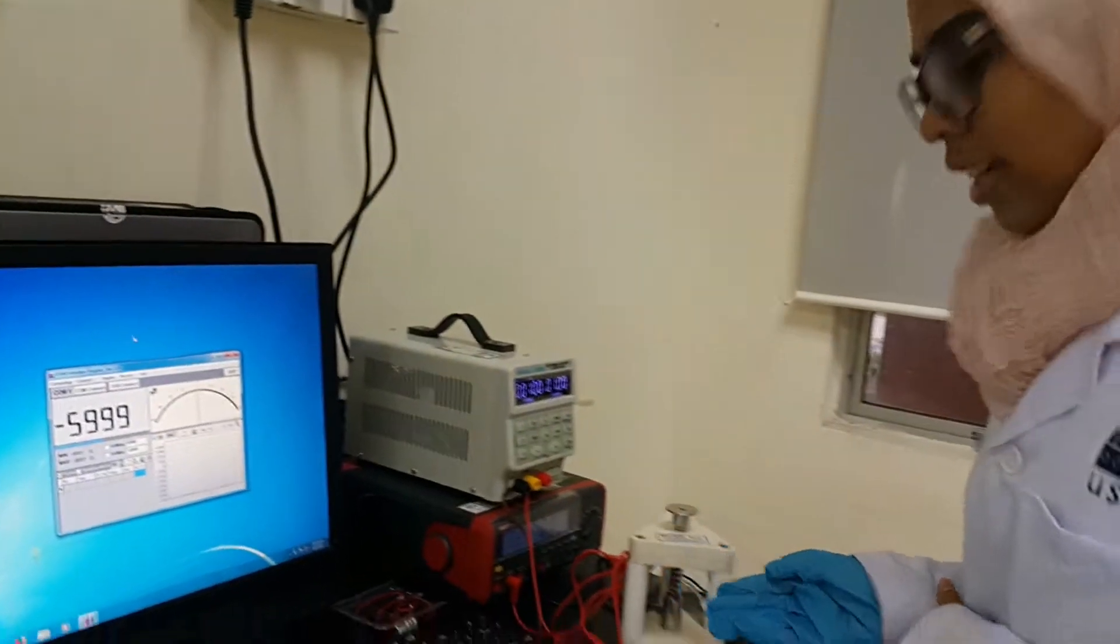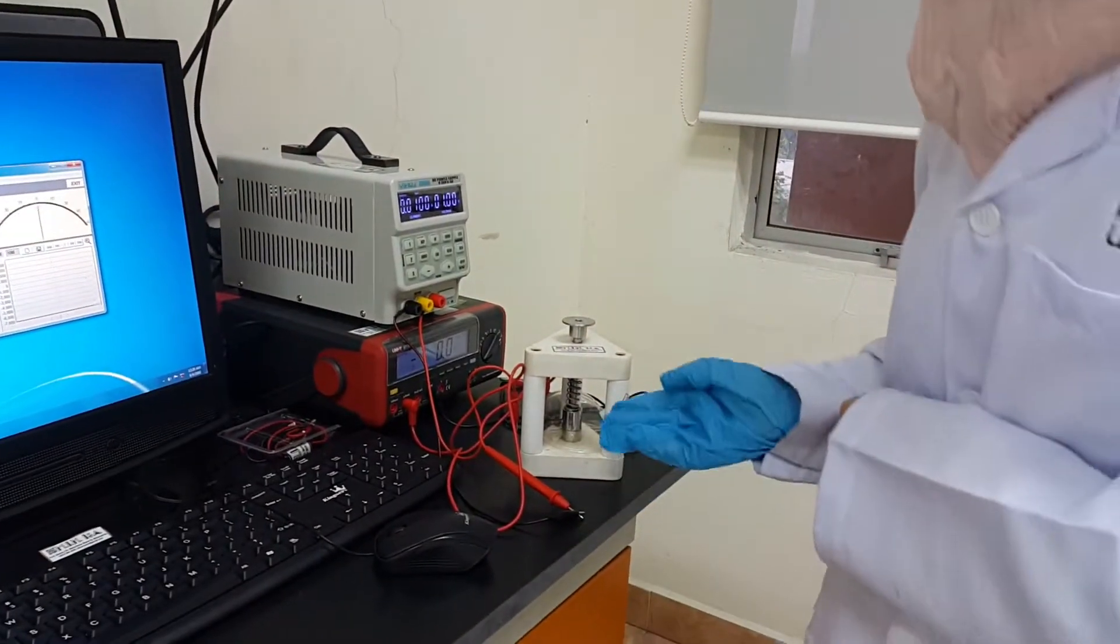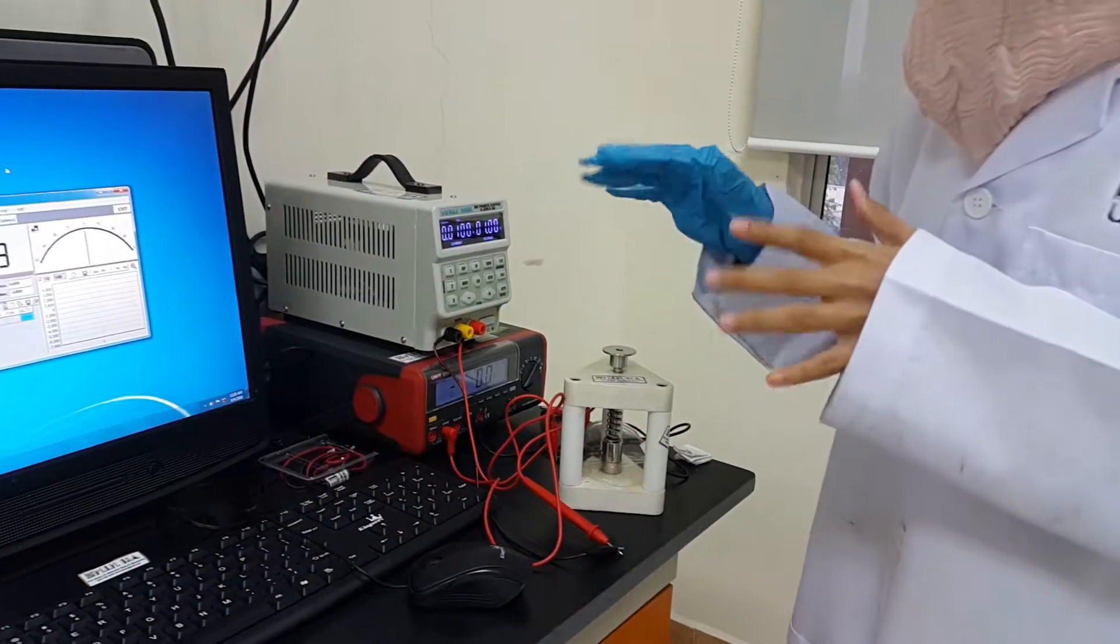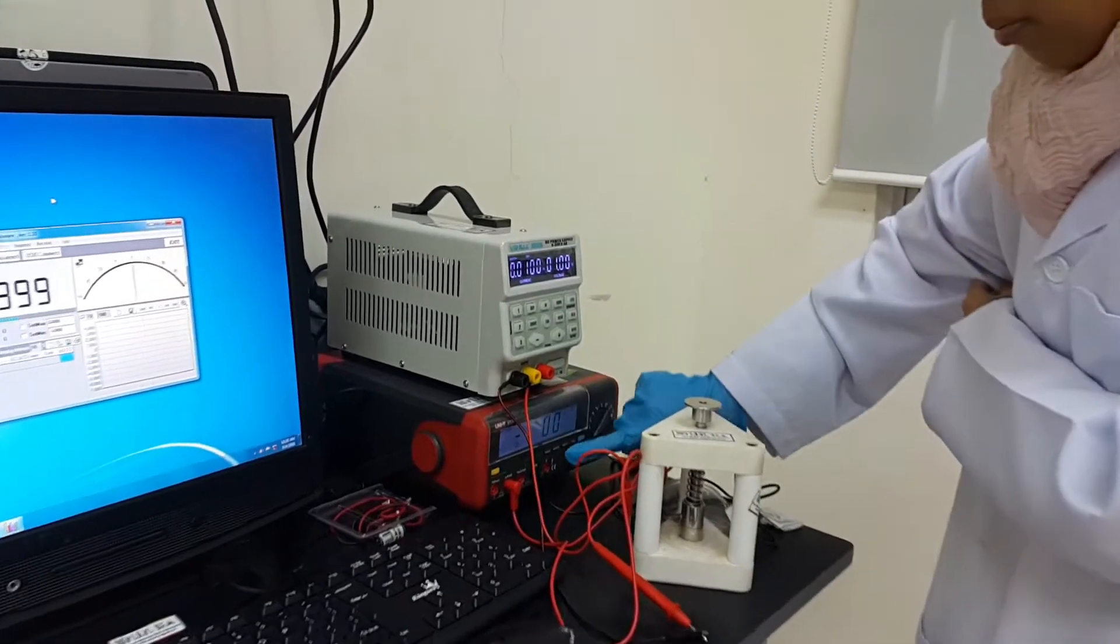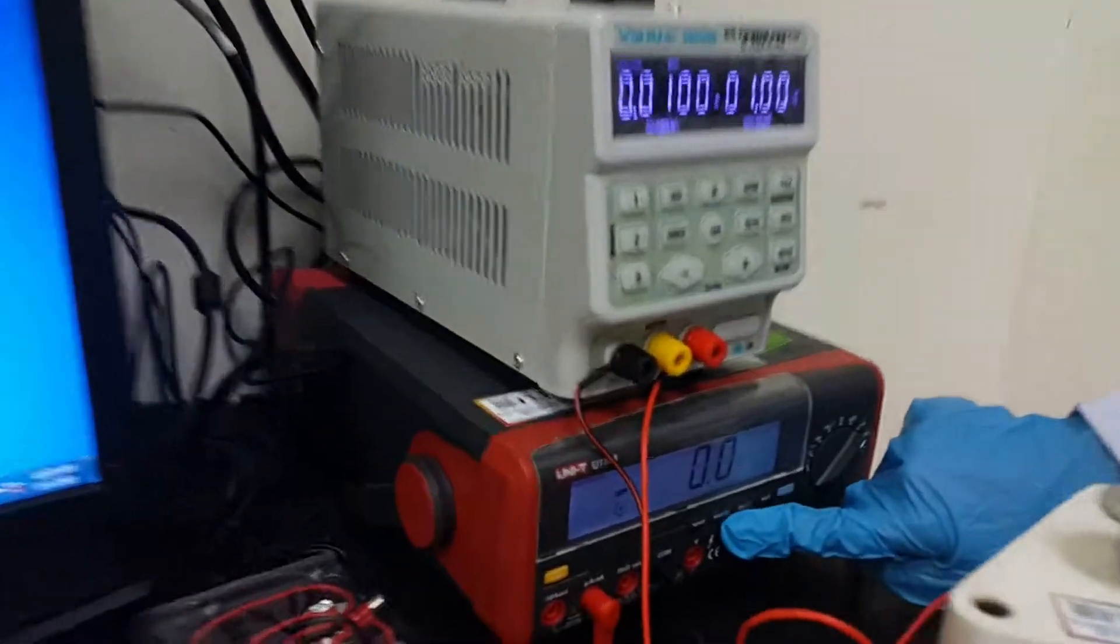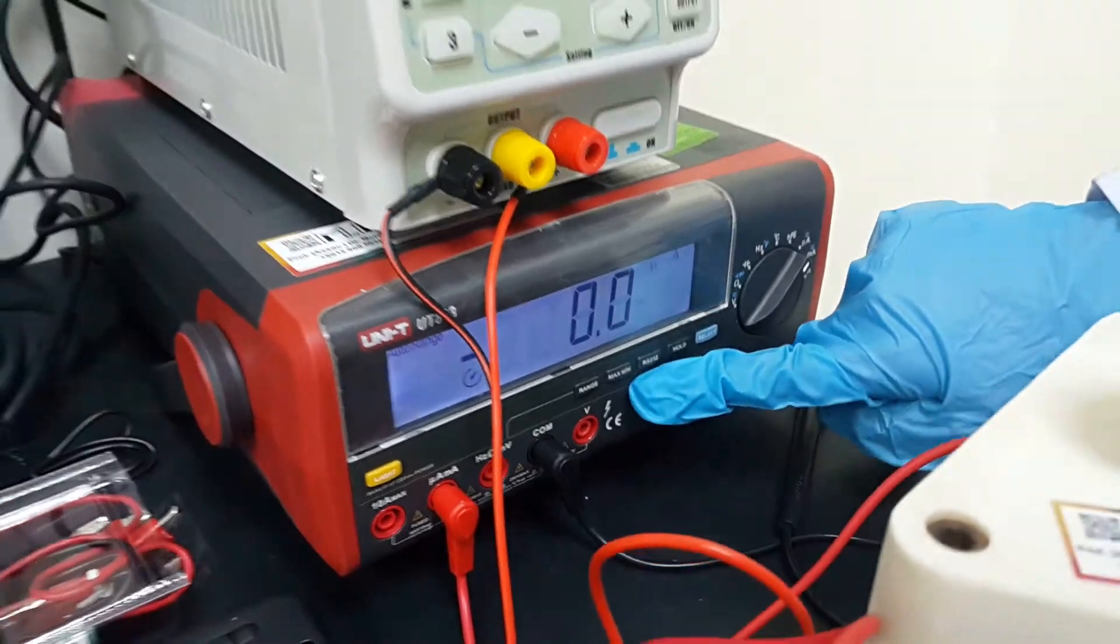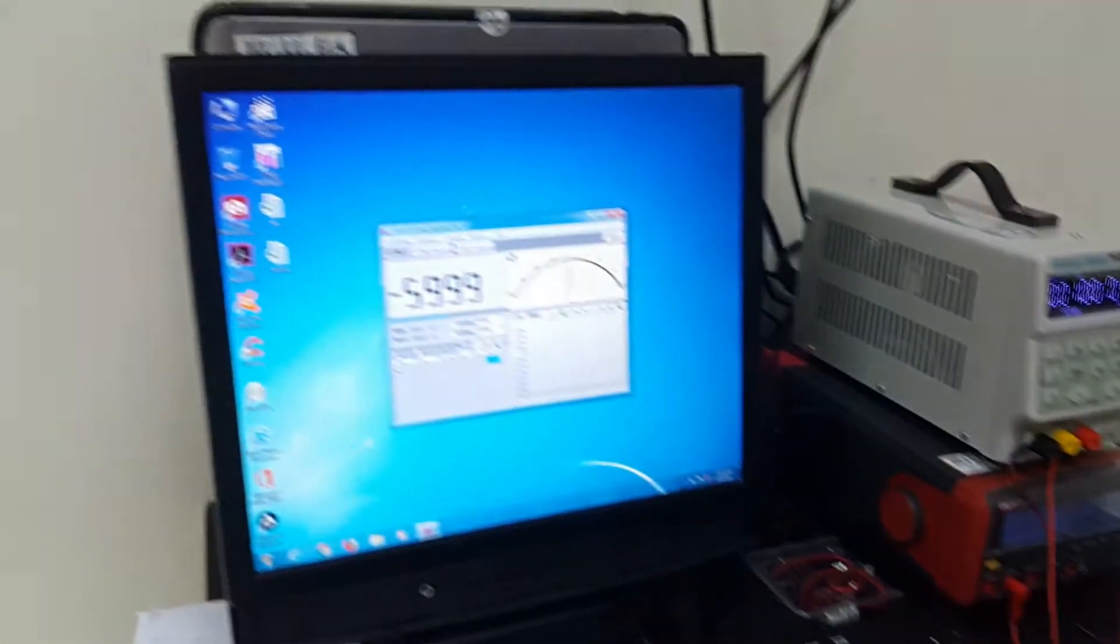I've already have my sample here. And then, before we run this, make sure we have to push this RS232 button and we click the USB connect.